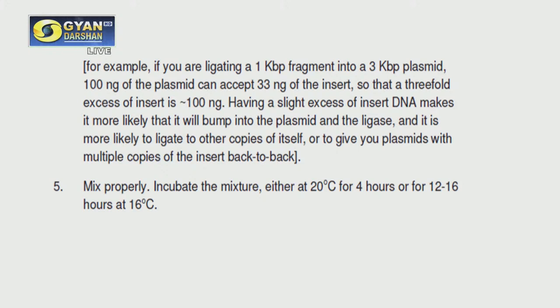If you are ligating a 1 kilobase pair fragment into a 3 kilobase pair plasmid, okay? So the plasmid is 3 times larger than the foreign DNA. But what we need is, we need the foreign DNA. How much excess? 3-fold molar excess. Because we said 3:1.